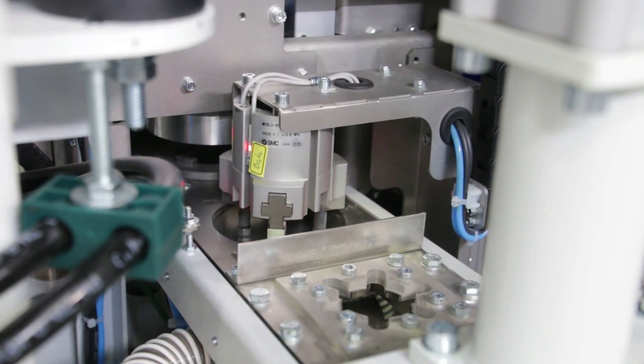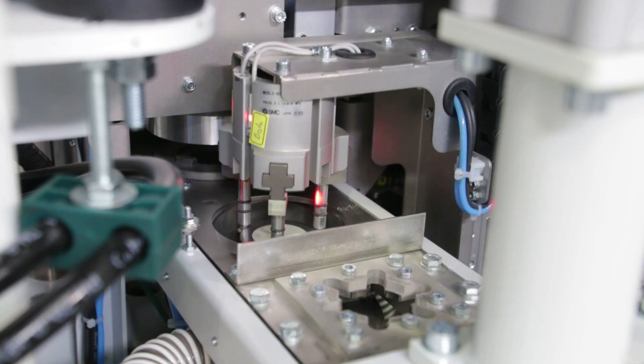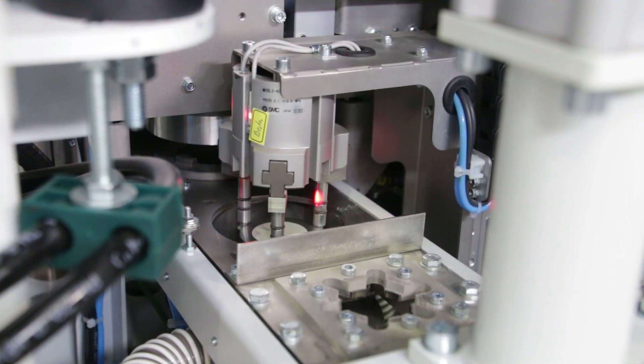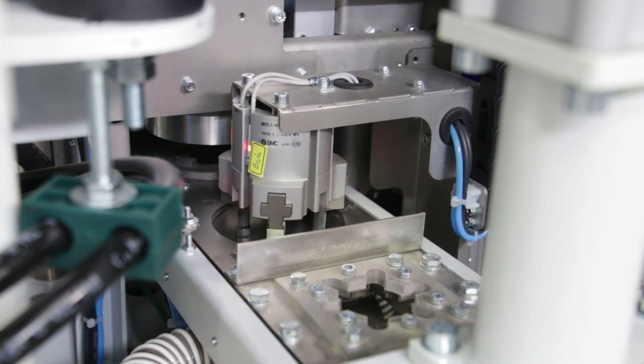With full confidence in reliable sample preparation and analysis by the HPMP, you can fully concentrate on your work.